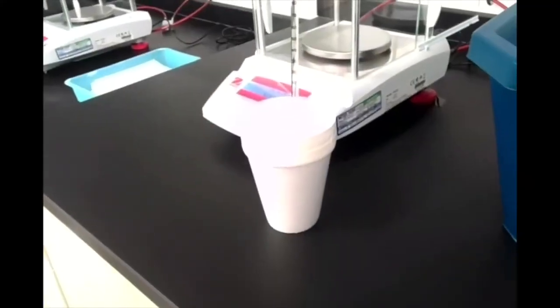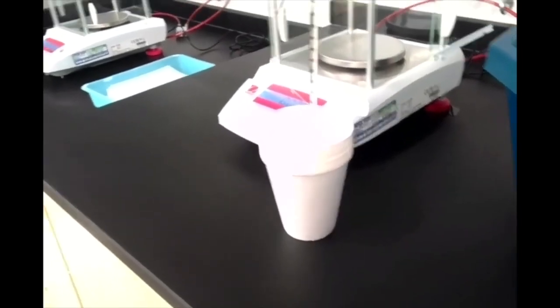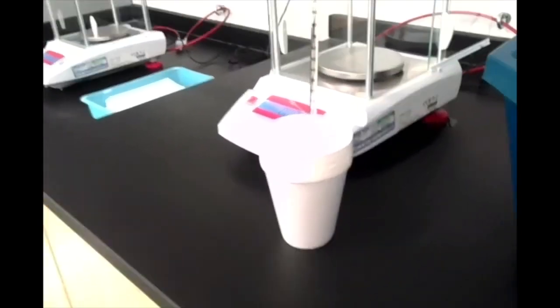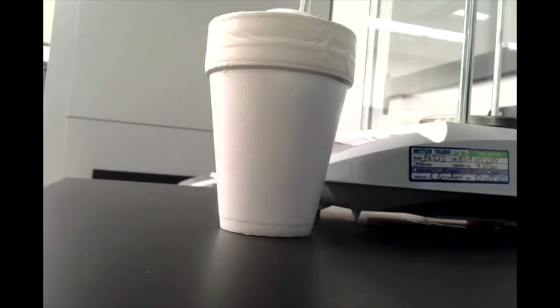Now that we've got the initial temperature of our water, we're going to add some ice to this water and keep track of it, and hopefully we'll drop the temperature down to about 2 or 3 degrees Celsius. So let's go ahead and do that right now. The ice.